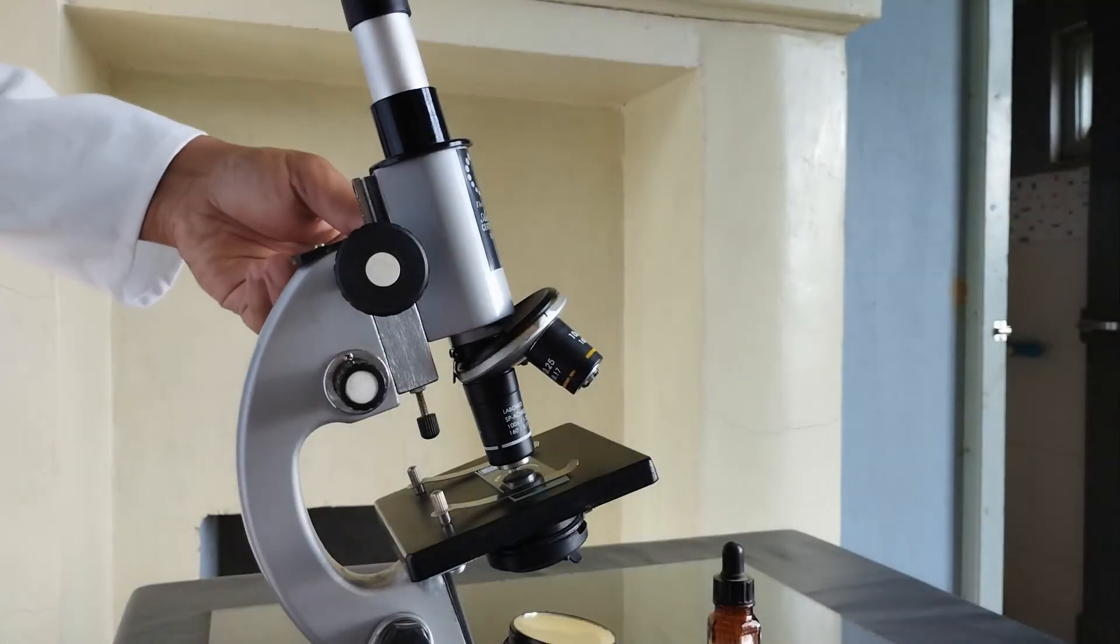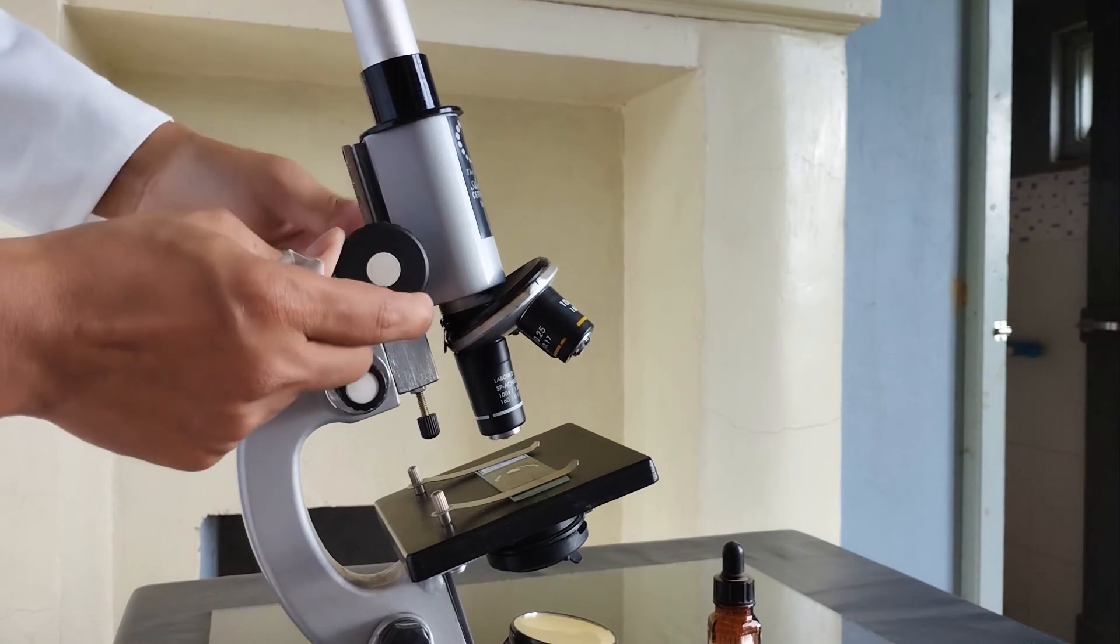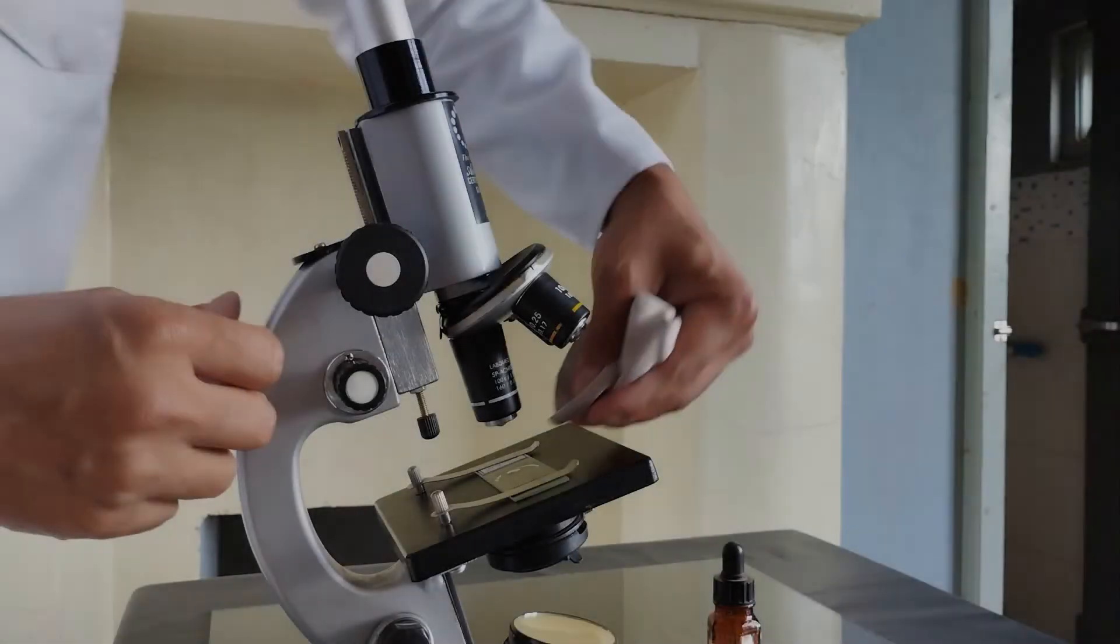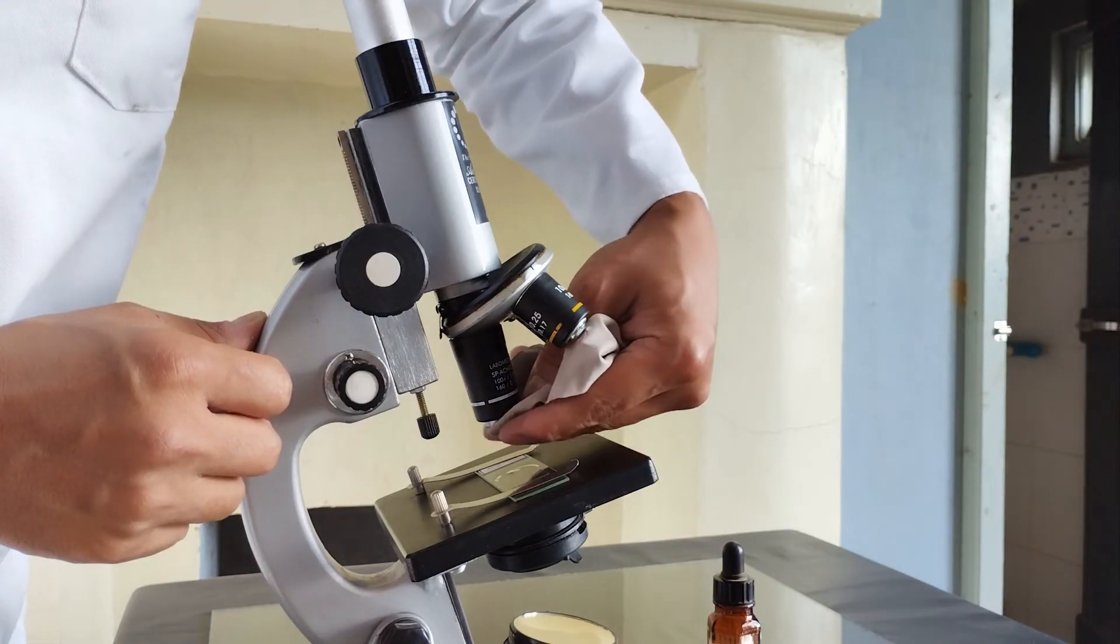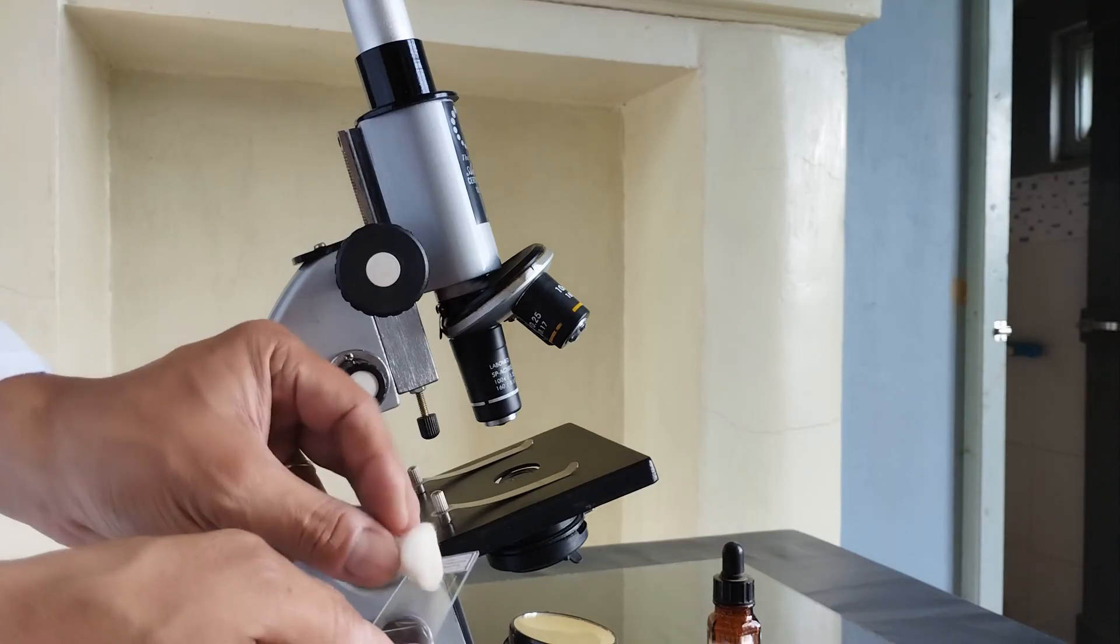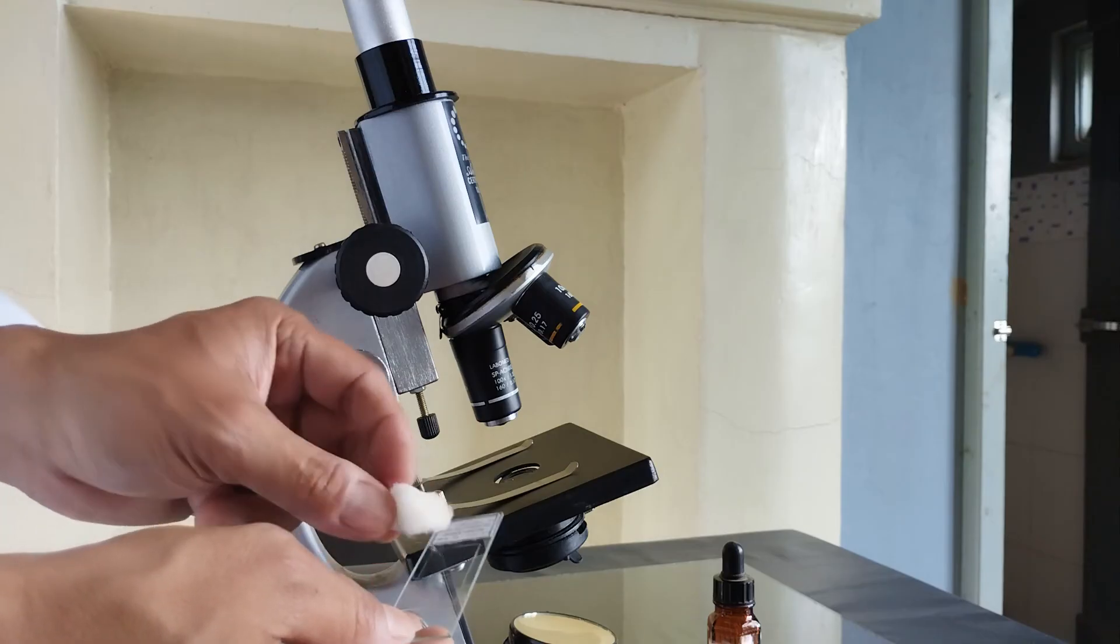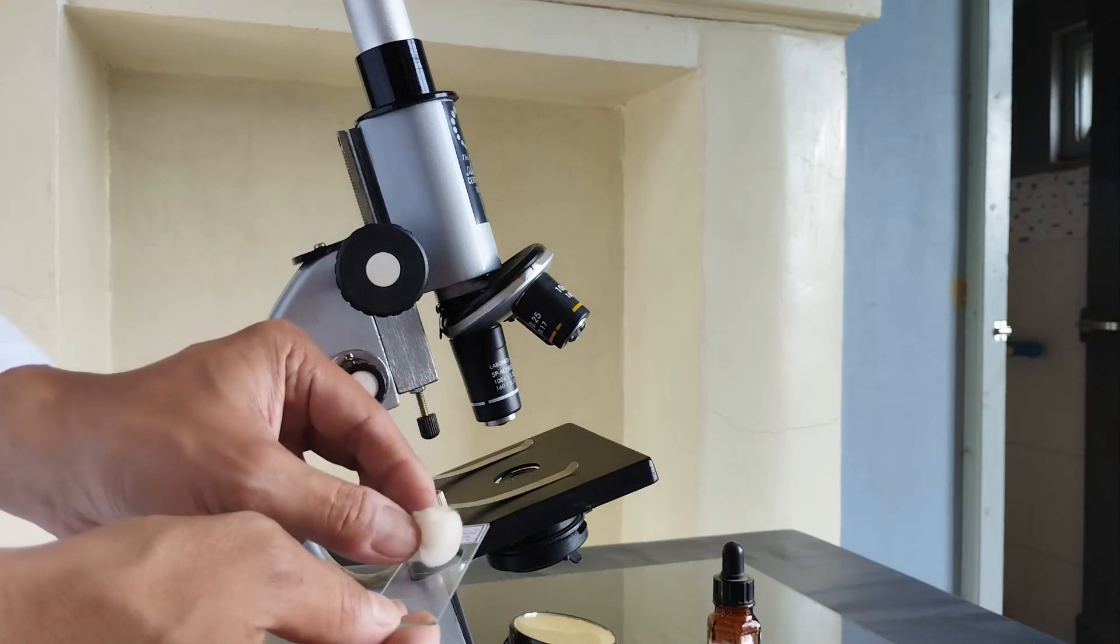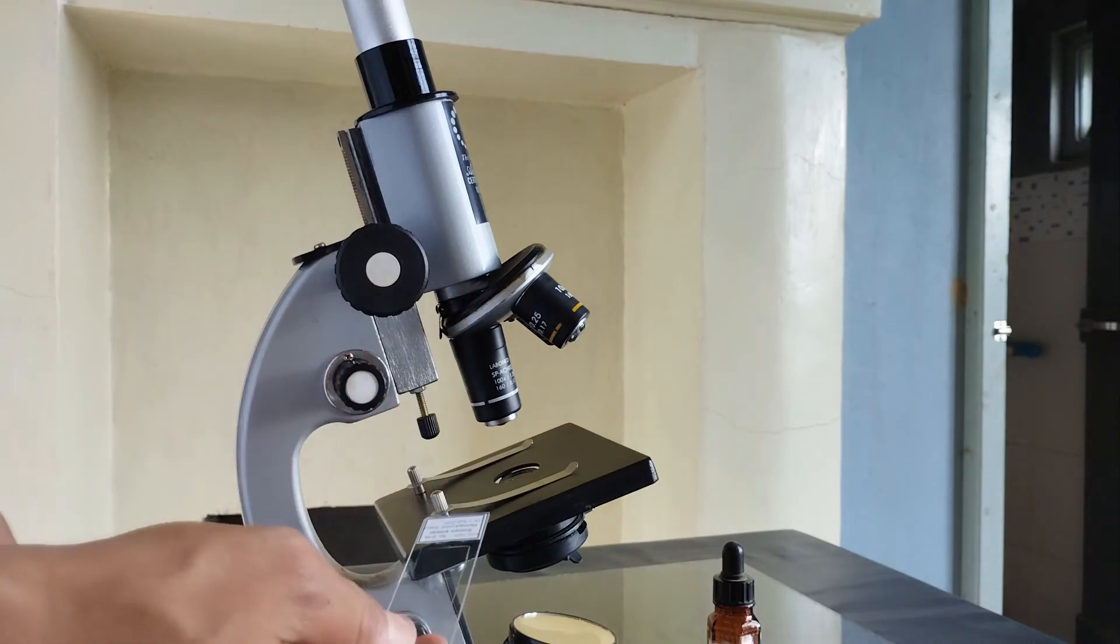Once you're done examining the slide, lift the objective to a fairly high point using the coarse adjustment knob. Wipe the residual oil off of the objective lens using a clean and dry piece of lens cloth or lens paper. Also wipe the oil off from the slide using a cotton ball dipped in acetone. Do not use harsh chemicals such as organic solvents for cleaning microscope lenses. You may however use ethanol or isopropyl alcohol of 70 to 90 percent concentration for cleaning.